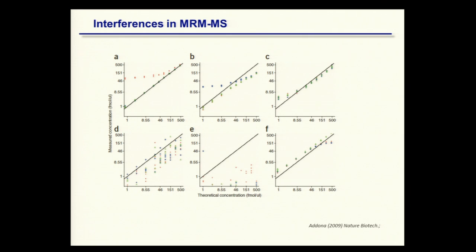the expected line. There is also another issue that we may have in MRM-MS analysis, which is more related to the whole performance of the LC-MS system or not recovering the peptide at all. Or in this particular case, it's more like a saturating detector, so the most abundant transitions are not aligned, but are reaching the saturation point. So all of this is important to detect and avoid.